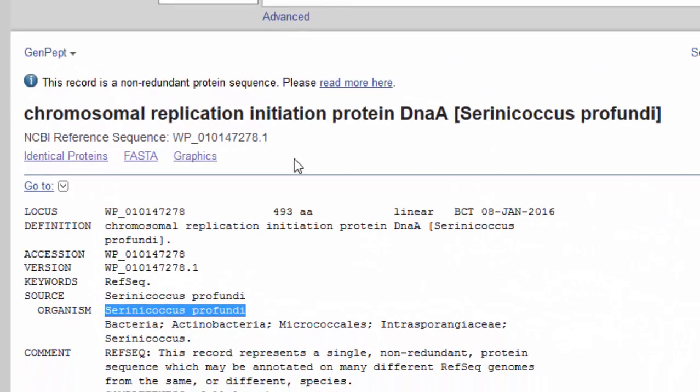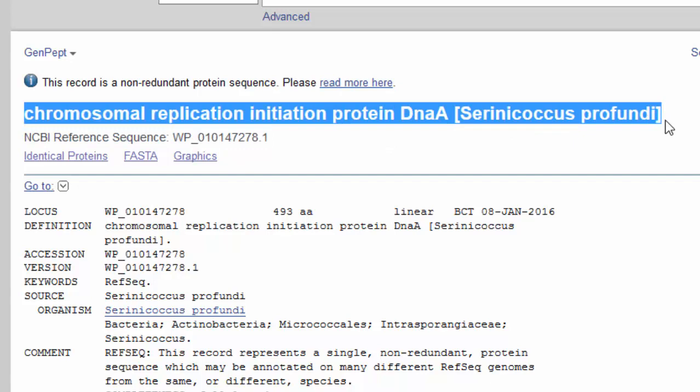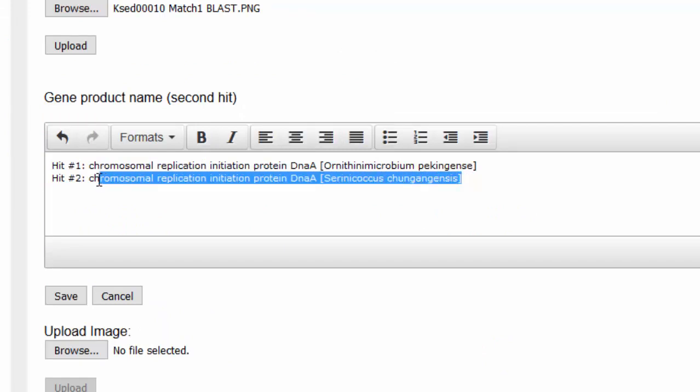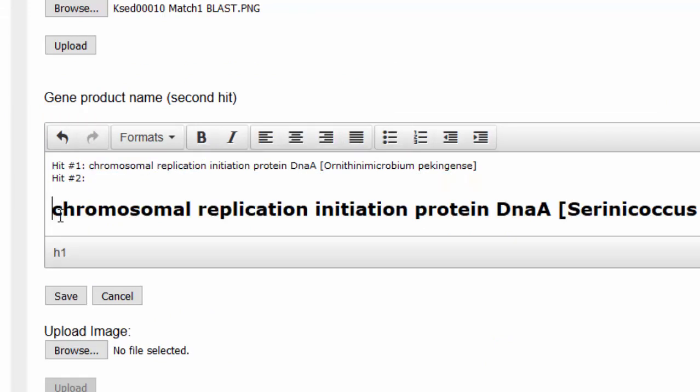And fix this up here. I don't know if you saw what I just did, but I missed the proper one. I didn't go right underneath the other one. So I'm just fixing it. It's the same genus. It's probably not a big deal. We're going to make sure that it matches perfectly.